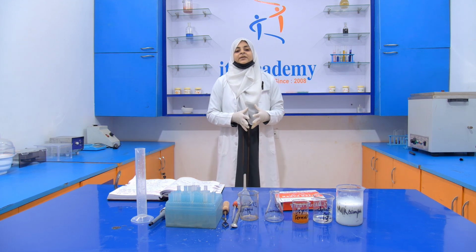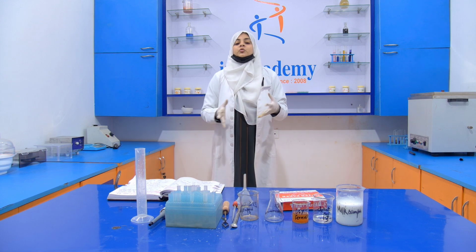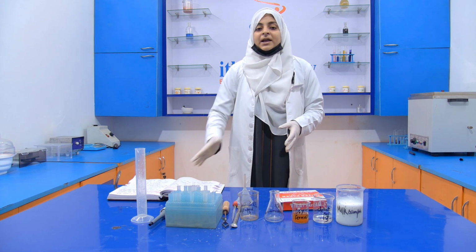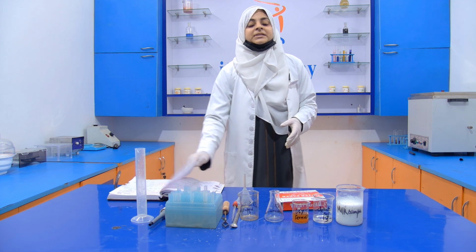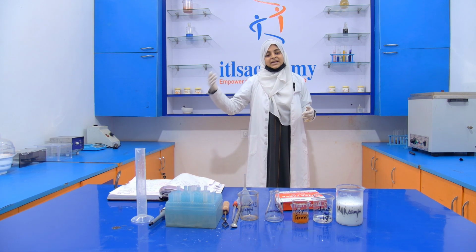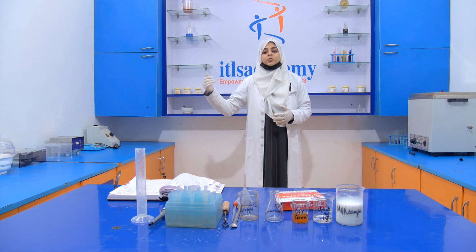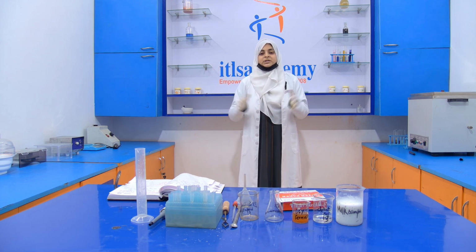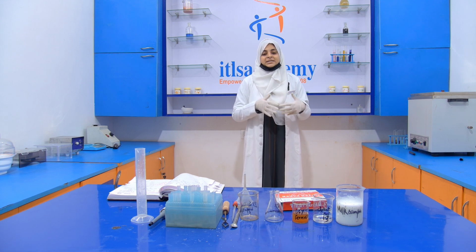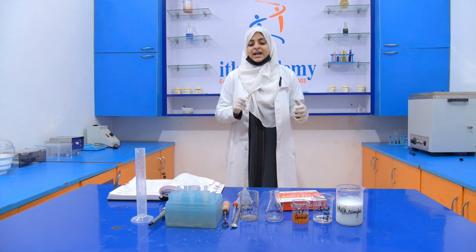When we collect the filtrate, after that we add 2 to 3 drops of ferric chloride into it. If benzoic acid is present, then the solution turns pink, and if salicylic acid is present, then the solution turns violet. So this is about the detection of benzoic acid, benzoate and salicylic acid.